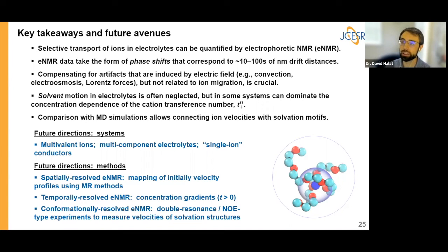And that's one of the challenges in looking at quadrupolar nuclei, I think. Lithium is quadrupolar, but for the most part, we treat it as though it's not. But things like magnesium, zinc, sodium, those are going to be more challenging. I think it's possible to extend the technique to those systems, but it's going to require some ingenuity to design pulse programs to do that.